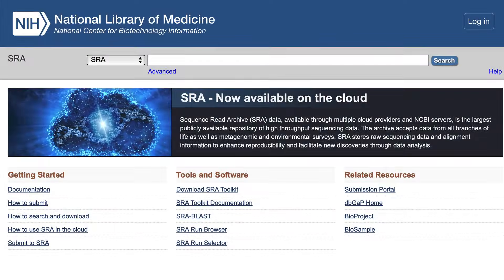The Sequence Read Archive, or SRA, is the largest publicly available repository of high-throughput sequencing data. The archive accepts data from all branches of life, as well as metagenomic and environmental surveys.